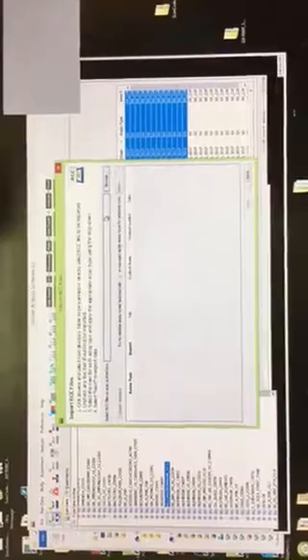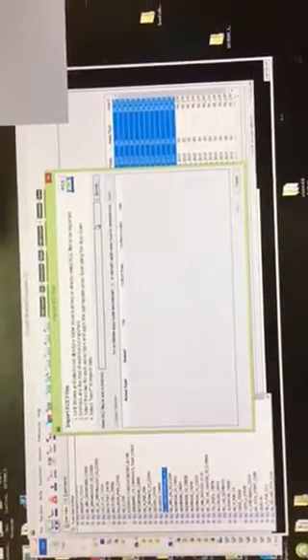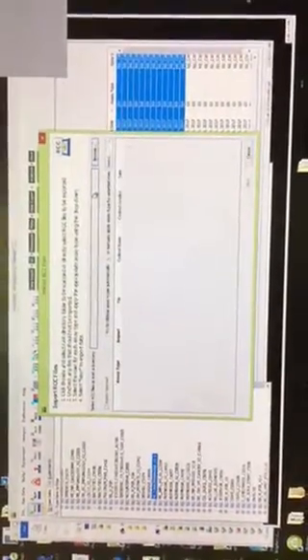Yes, and we work with a lot of customers who receive the data and do the analysis, but they actually weren't involved with running the assay. So if you find yourself in need of an RLF, we have them all here. Just reach out to support at NanoString, say I need this RLF, and it's very easy for us to send it to you. But for basic analysis, the RLF is not needed.